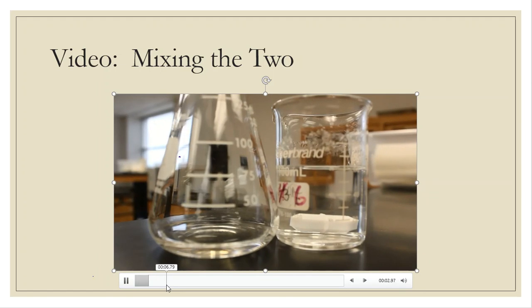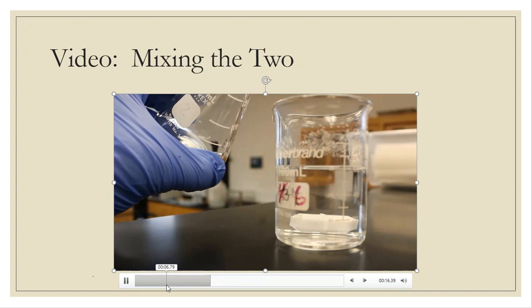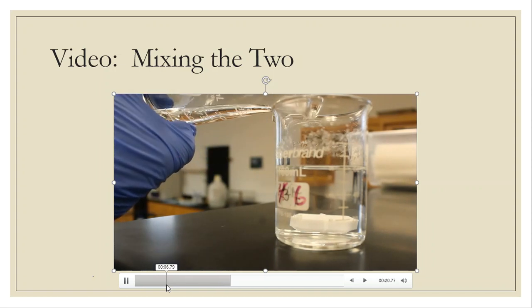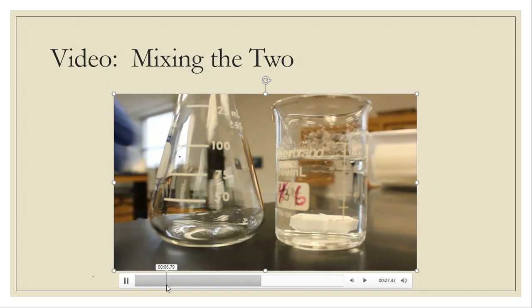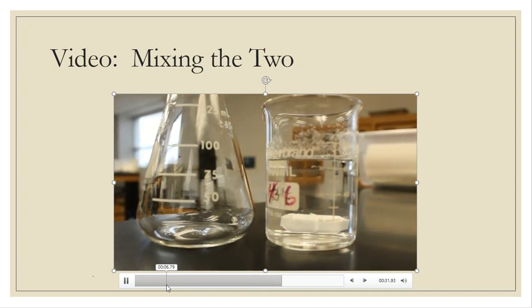So this tells me to add the alkane mix, which is in the Erlenmeyer flask, to the warm methanol with the urea that's over here to the right-hand side. That's what I'm going to do, and I'm going to show a video of that process just so you can make an observation if you want. So I'm going to quickly add the alkane mix to the urea mix, and there you go. That's what it's doing. It then tells me to rinse out that Erlenmeyer flask with a little bit of methanol. That's what I'll do.